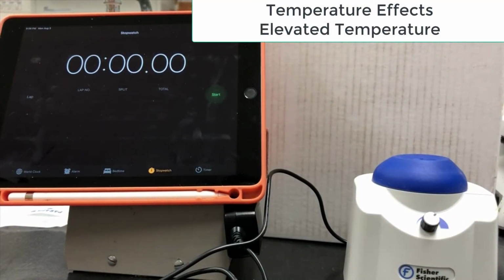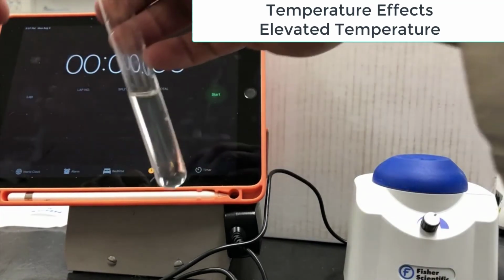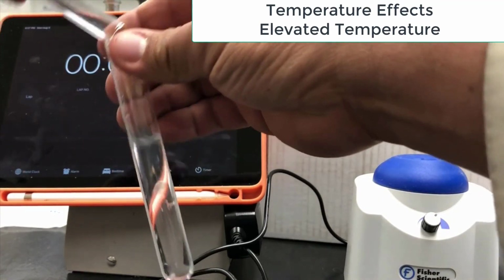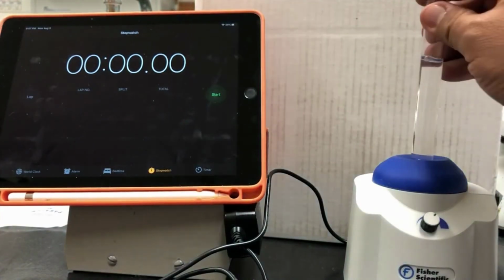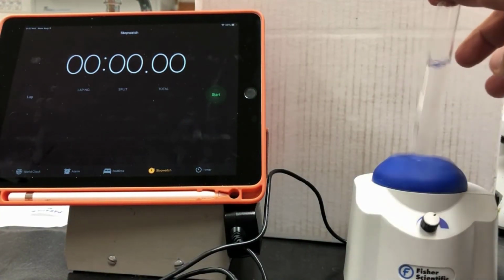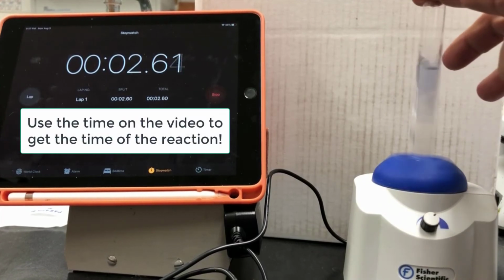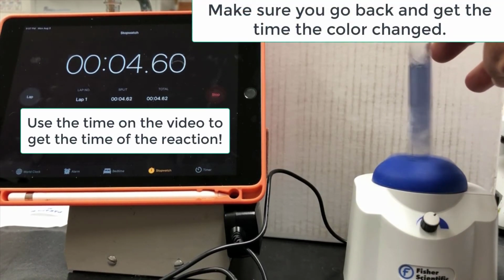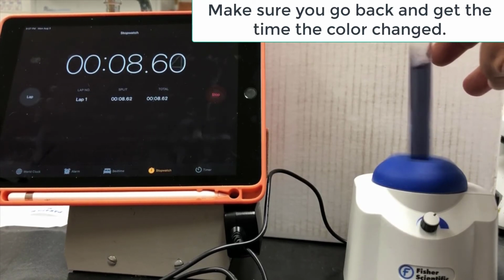So for the next experiment, we're doing an elevated temperature. I just took some hot water and sat the test tubes in there for a little bit, for about 2 minutes, until I got about to where I wanted to be in temperature. Oh, and we'll start that up. That was bad. Oh, darn it. See how quickly that changed. We should probably redo that. That'll make a significant impact.